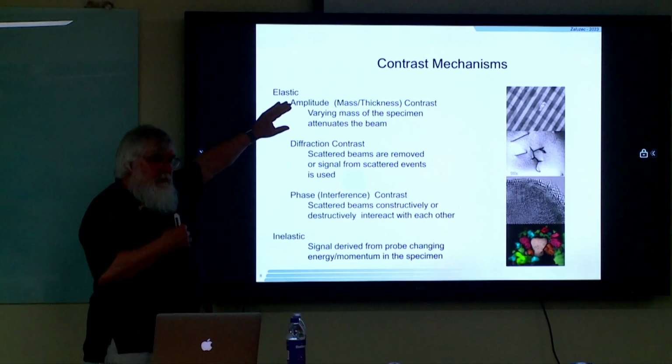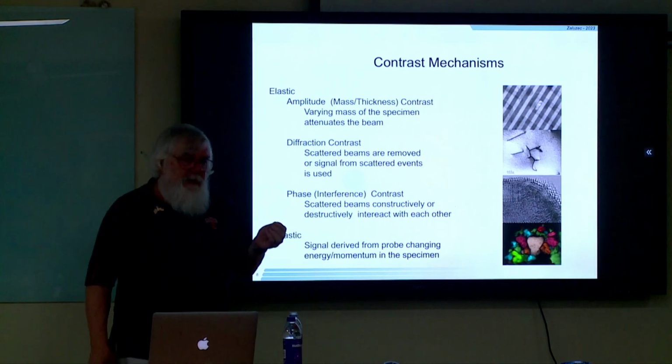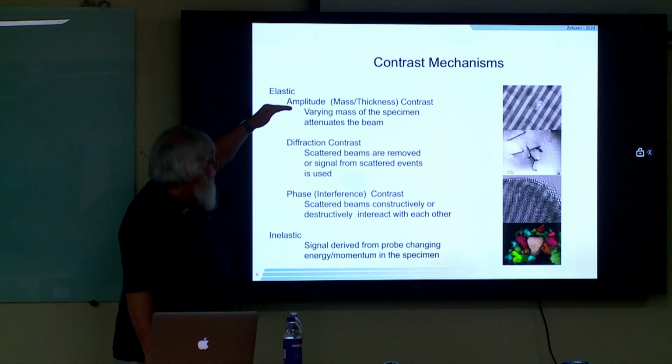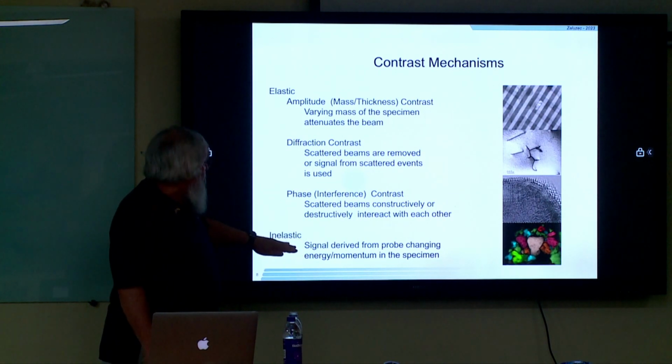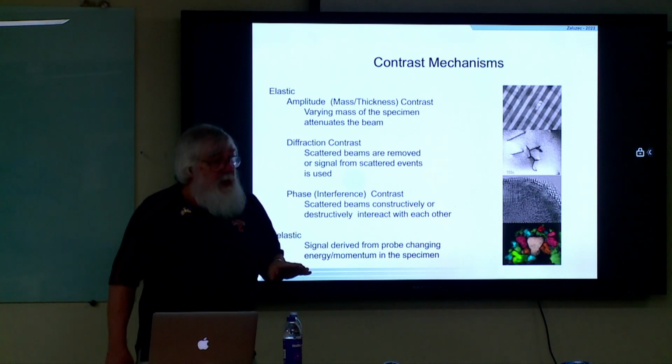All right. So most of the things we'll be talking about today are elastic contrast. So elastic contrast is either the amplitude contrast or the diffraction contrast. We're not looking at inelastic scattering. That's this afternoon. Okay? All of these are considered elastic processes.